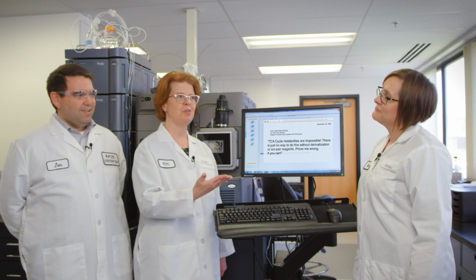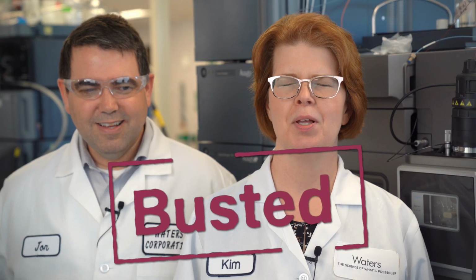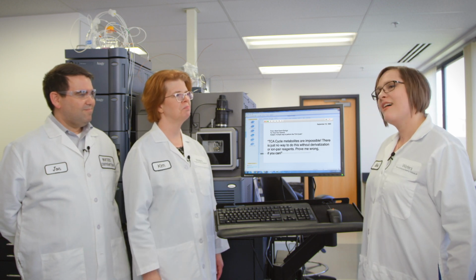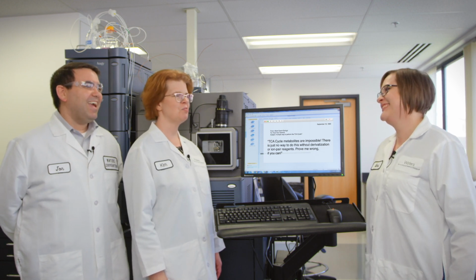So how do you want to call this? Oh, it's busted. Busted! So with the work you did, I mean, the challenge really was, is there a simple way to do this? And I think you showed with the simple mobile phase using acetonitrile, water, 0.1% formic acid, you can do it. Absolutely. With real samples. Would you do us the honors in writing this up? I would love to. Aw, thanks, Carrie.